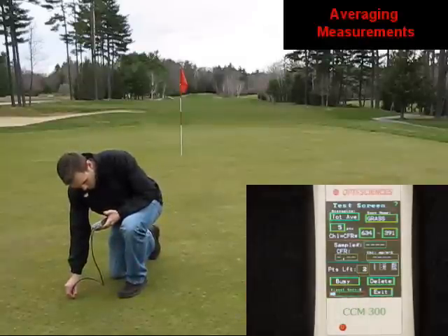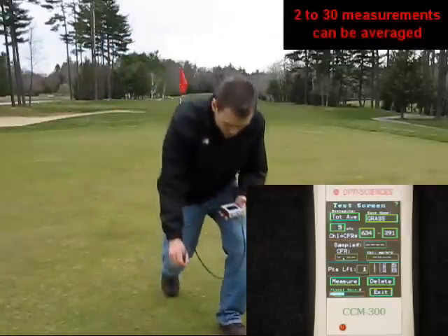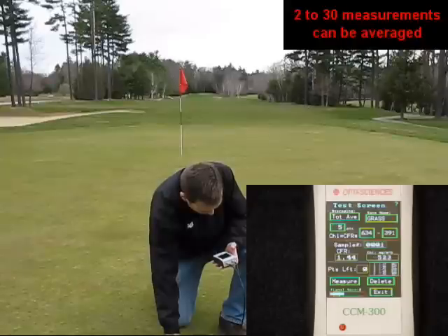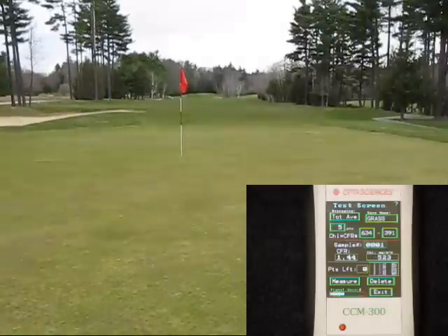Averaging values from 2 units to 30 units are possible. Here we show the averaging capability on turf grass.